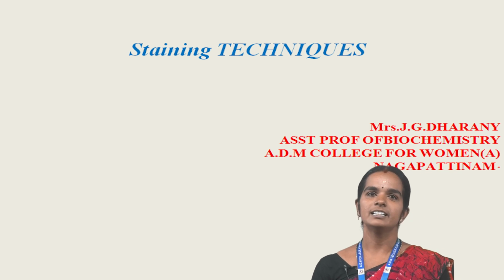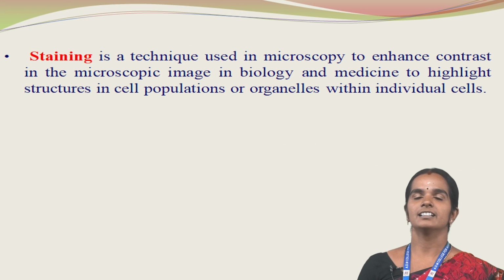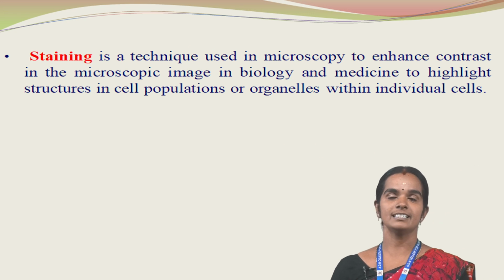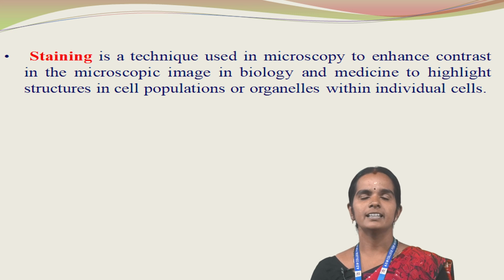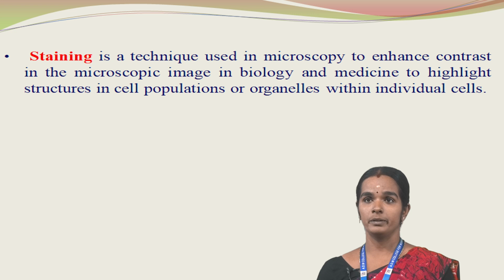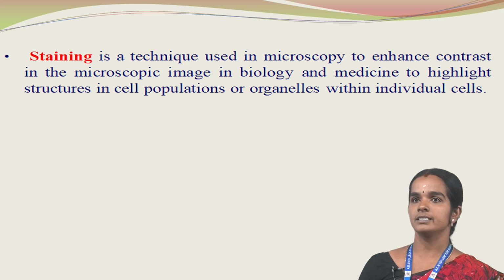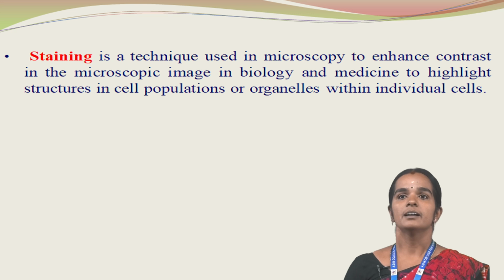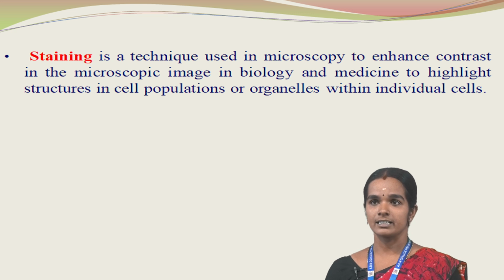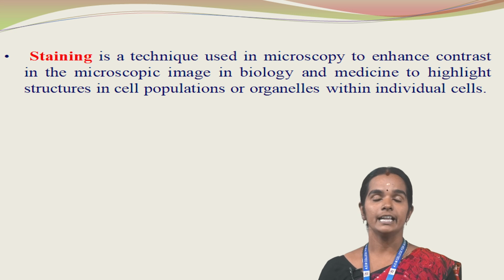Today, we will discuss the topic: staining technique. This is the introduction of the staining technique. Staining is a technique used in microscopy to enhance contrast in the microscopic image in biology and medicine, to highlight structure in cell populations or organelles within individual cells.